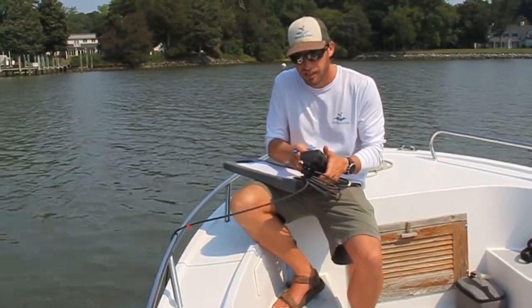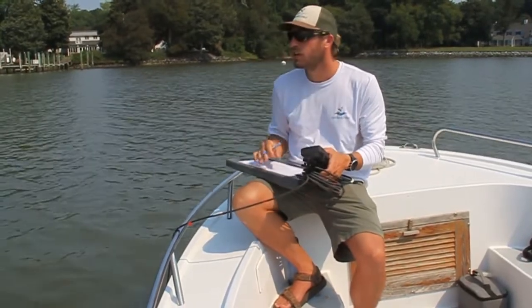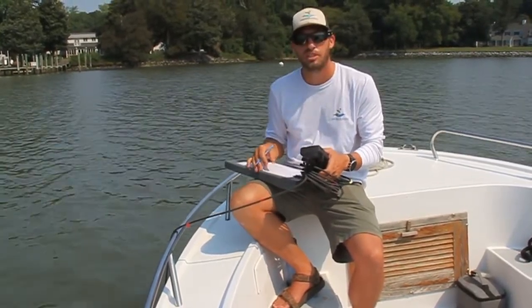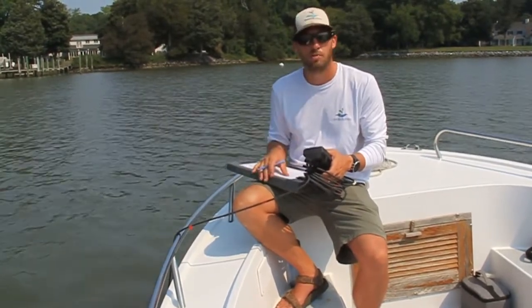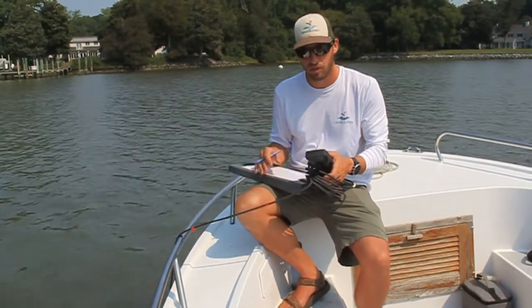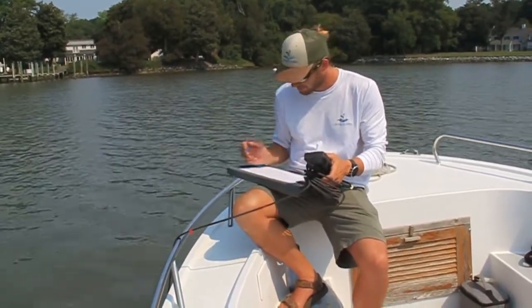And then the salinity here is 10.37. And to put that into perspective, we're here on Island Creek, which is around the mouth of the Tred Avon River, towards the lower part of the Choptank River. So 10.37 is right on par with the salinity that we'd like to see in this area.